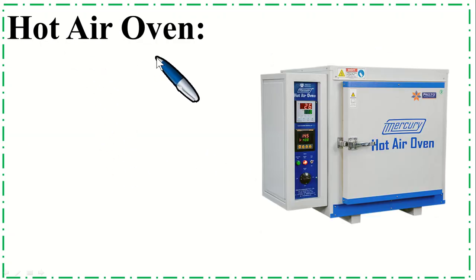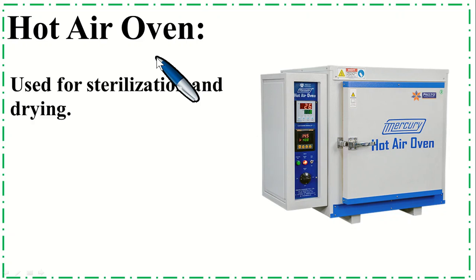Hot air oven. Hot air oven is used for sterilization and drying.